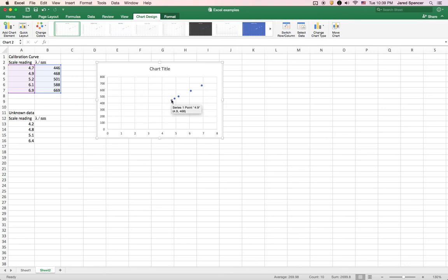And you have to have a trend line added with an equation. Everything else is optional. But the first thing I'm going to do, notice that there are lots of different places I can select in here. I can select the chart title, I can select kind of the entire chart, I can select the grid lines, I can select the plot area, I can select axes. So you have to be careful that you're selecting what you mean to when you're working with a chart in Excel.